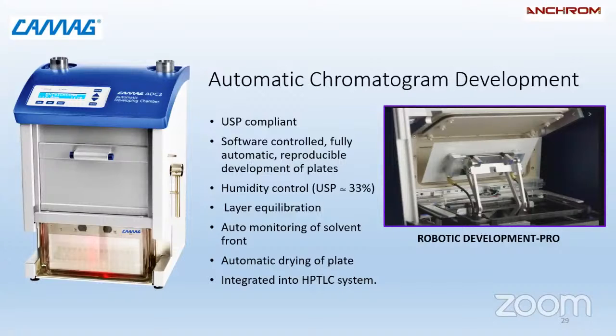To control this, the automatic development chamber is introduced, in which we can control the humidity, and the plate is exposed to the vapors of the salt, and then it is sent for development. That means all the important steps of the development, that is chamber saturation, plate drying, plate development, everything is controlled by the instrument. Plus we have control on environmental conditions. Basically we are trying to remove here operator error as well as the errors which are caused by the environment.